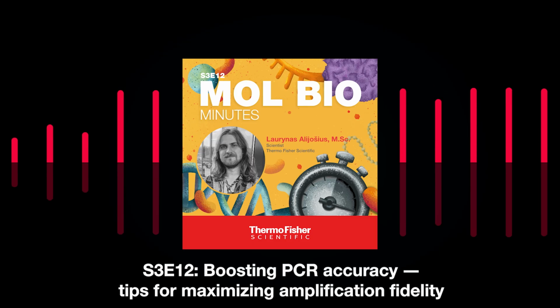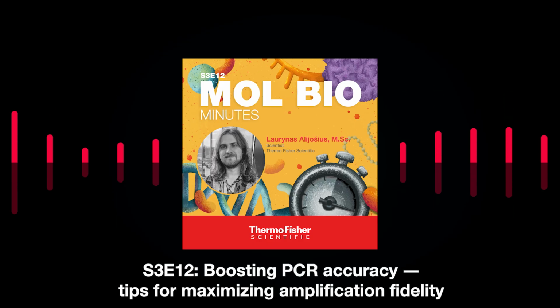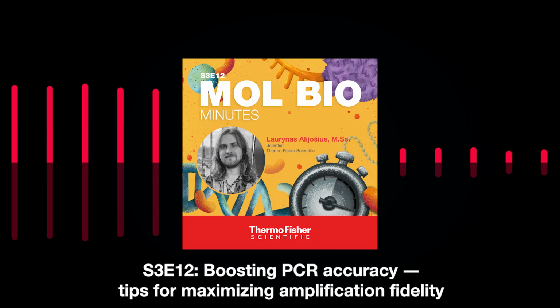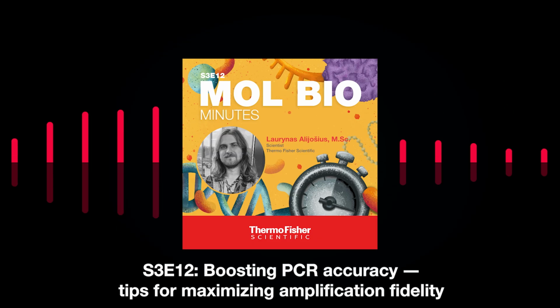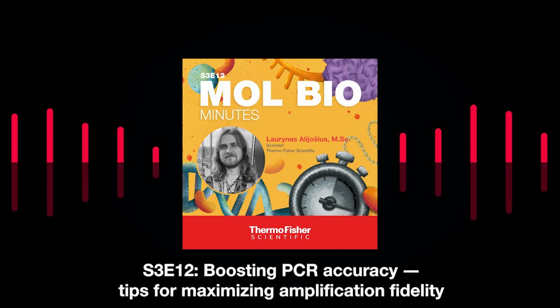Otherwise, if you need to use things like crude samples for a template, or you have to deal with impurities in your DNA template, then you could consider using a DNA polymerase that is resistant to inhibitors. So that could help you in this case a lot.